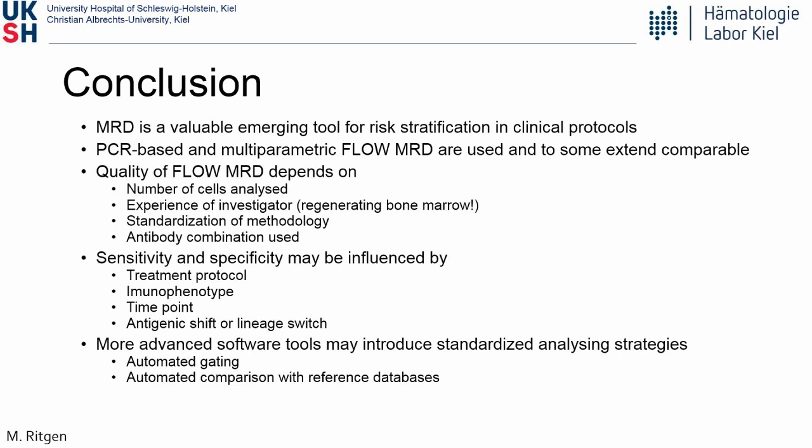Also, we're getting questions around many different markers, obviously. So we have one around CD123, and if you can give us any further information to distinguish between hematogone and residual blast. And can this give us further information? Well, I think it works, at least in the early time points, it works quite well. The problem is that it is often rather weakly expressed, so you need it at least in a quite bright color. But I think it's a valuable marker, and I like it a lot.